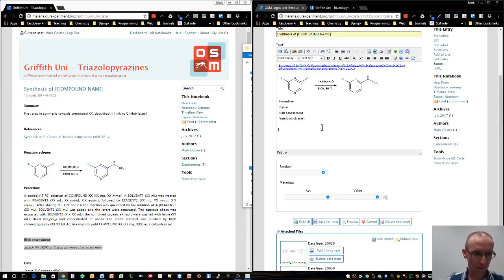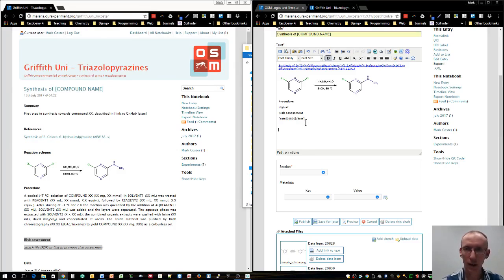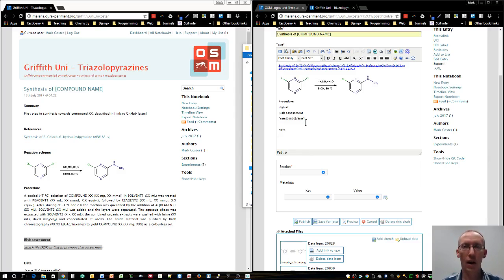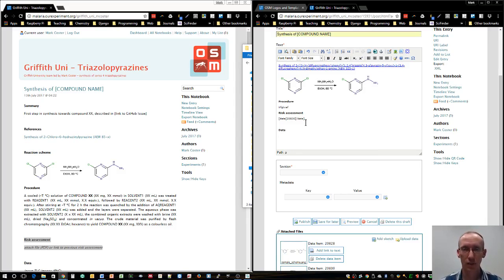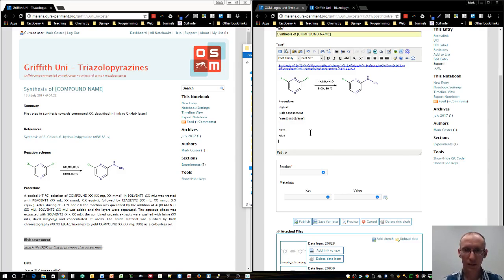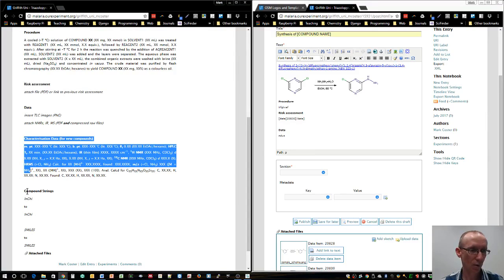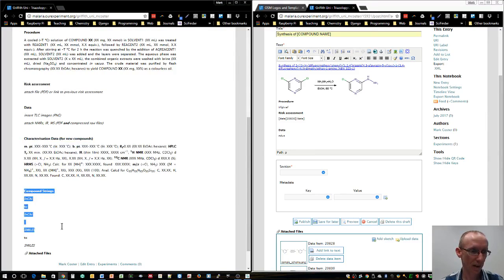After that, we can put in our data. We can have that as further PDF files or zip files for raw data and so on. Then finally, I won't go through characterization data here. I will go through compound strings.